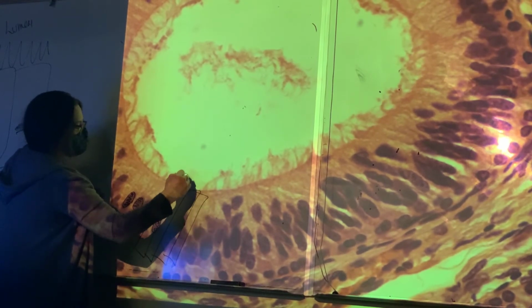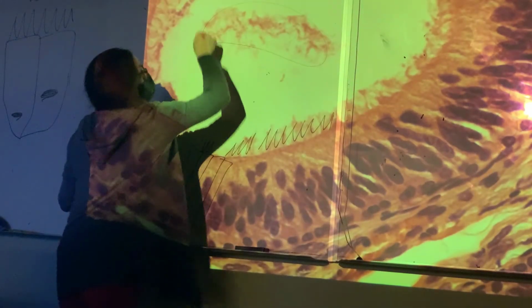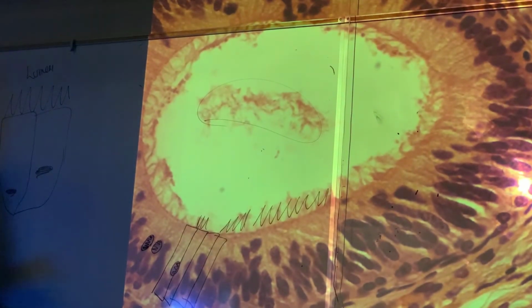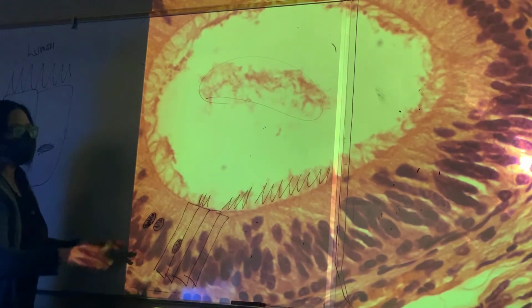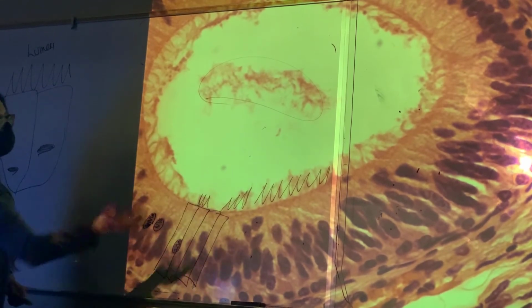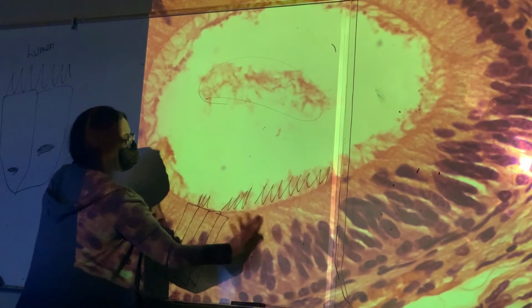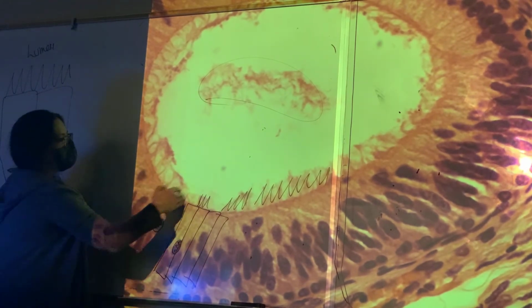And then out here you can see these nice, really long microvilli. Now, this epididymis happens to have some sperm cells in it. You may or may not have sperm cells, so definitely don't use that to help you identify it. But very clearly, you see purple nuclei. You definitely don't see cells in different stages of cell division. Cells are lining up more. You definitely see a nice part of the cytoplasm of these columnar cells, and you've got your microvilli.